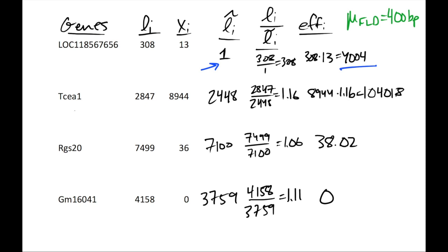And then I guess with this hypothetical gene, GM16041, I just wanted to put an example in there. If the count is 0, then the effective count is also going to be 0. These two examples show that effective counts will often result in a decimal ending. This is okay, even though you would assume this is supposed to represent some kind of whole number count of RNA. Since we're already applying scaling factors, the decimal values are also a part of our final answer. Thank you for listening.